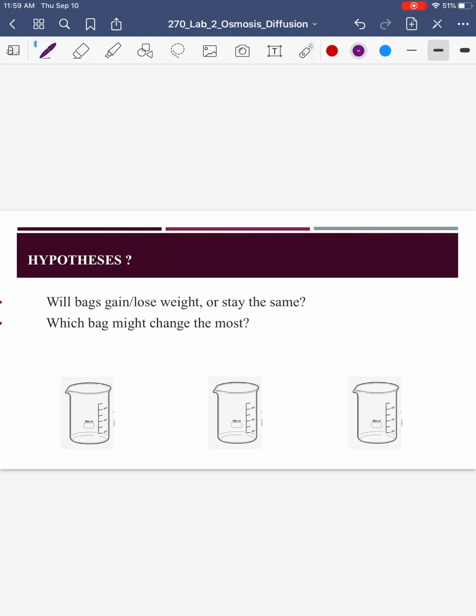Now, I couldn't just leave you hanging there without giving you a little bit more help. So let me explain more of what I was saying before. If we're trying to determine osmosis and diffusion, the easiest way to determine what's going to happen is to simply lay out the concentration inside versus outside.